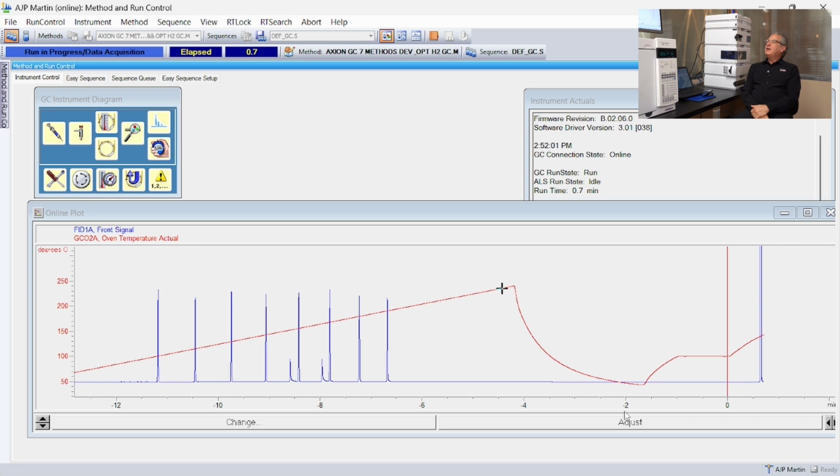Well, if there's something in there that's some active sites, imagine it's like Velcro, and it's sitting there and it's trying to stick onto my alcohol. If somehow the first time through I passivated it, I sort of covered up that Velcro with the first couple of alcohols, that maybe the next injection will be better. It's a crazy concept. It's sometimes called a loading dose, and there are examples in chromatography where it really works. More embarrassing than anything else, but it's in ion chromatography. It's not unusual to inject a huge concentration of like chloride first to just shock the column or sort of fill up all the active sites.